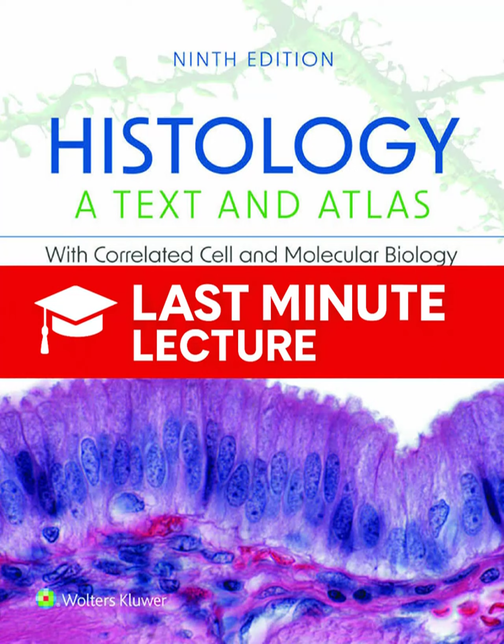The image isn't viewed directly, though. As you can see in Figure 1.14, the confocal uses a laser and scanning mirrors to excite the fluorophores spot by spot across the specimen. A computer then takes the signal detected through that pinhole and reconstructs the image, sort of like a CT scan.